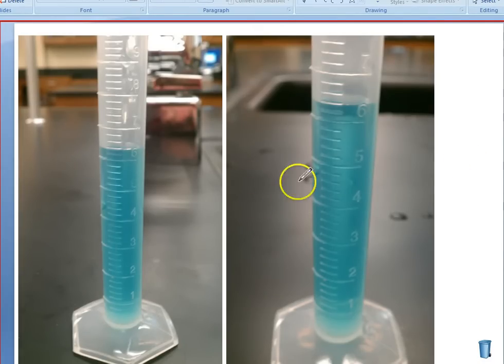So here I have two pictures of the same graduated cylinder. This one I think is a clearer picture, but this is a little bit zoomed in, so you can see exactly where that water line stops. Each of these markings, the 1, 2, 3, 4, 5, and 6, is a milliliter. I can see that I have 6 milliliters and then a little bit more. It's not all the way up to 7, so I need to figure out how much more I have.